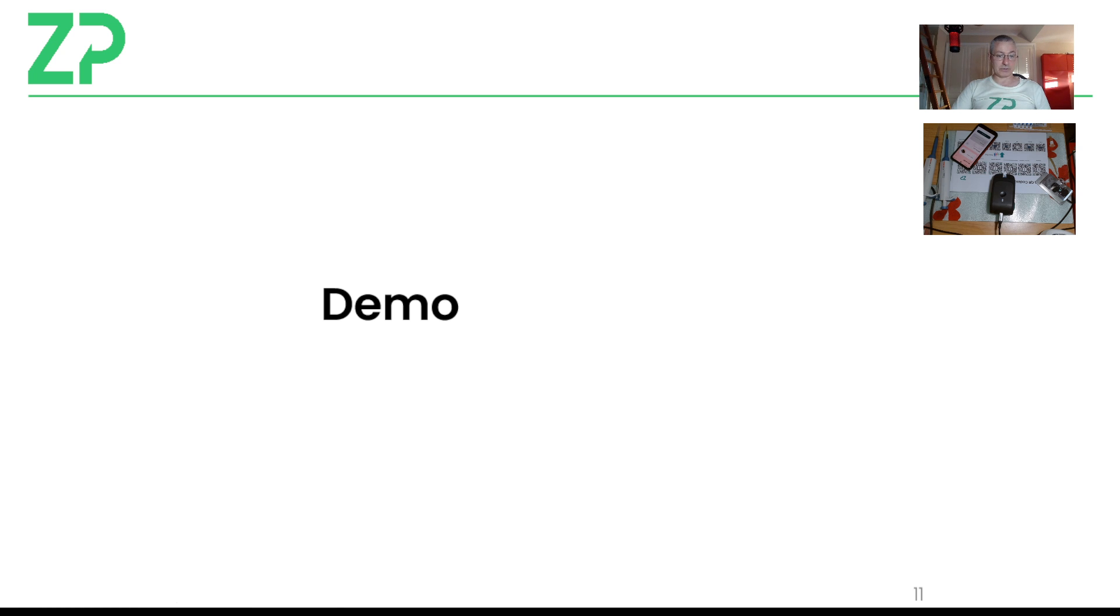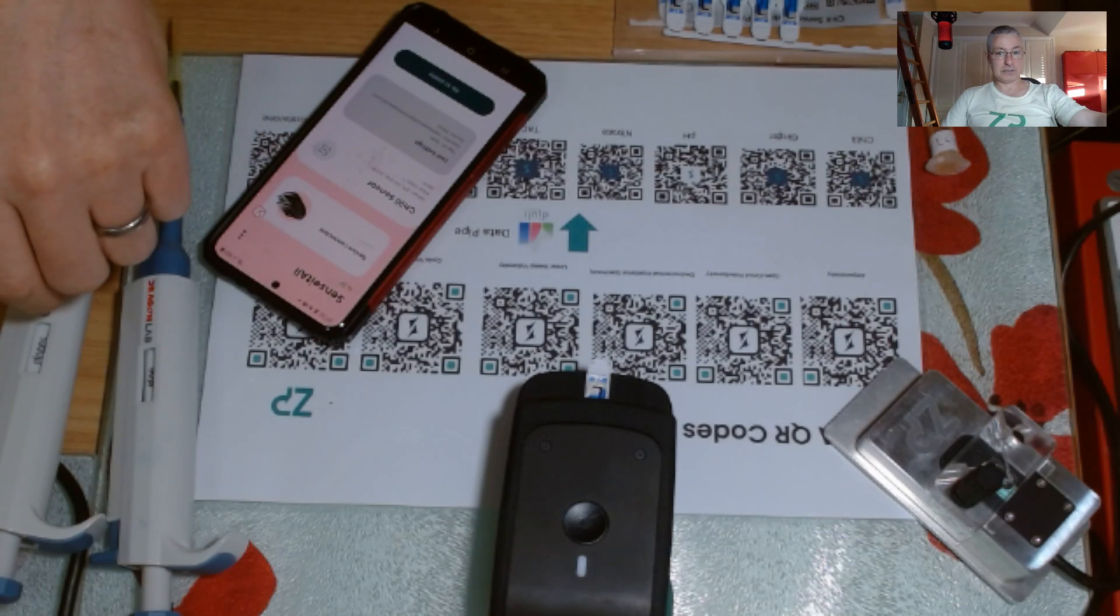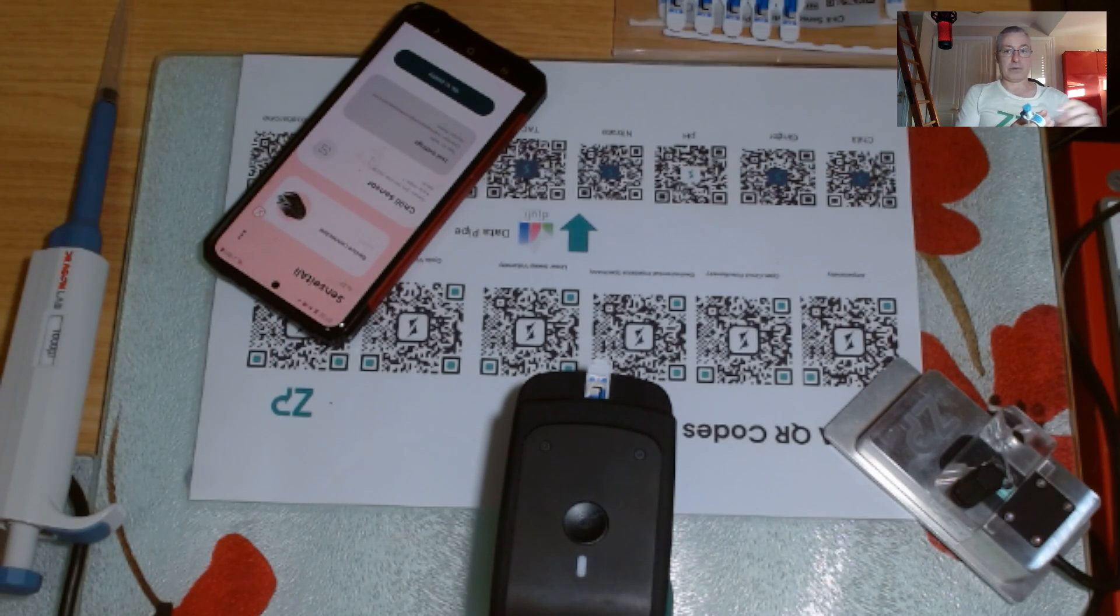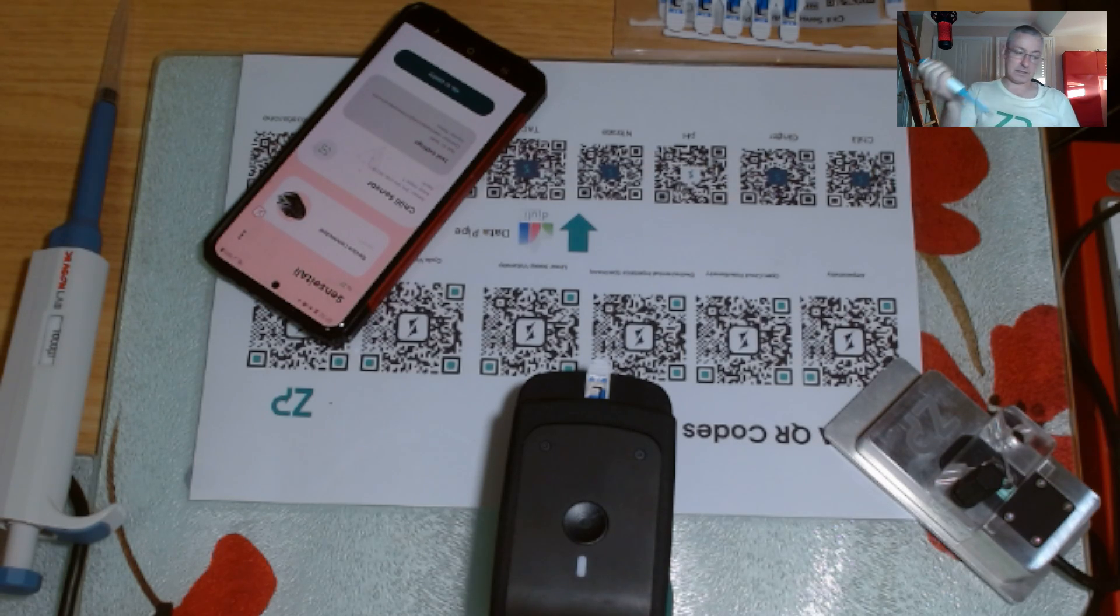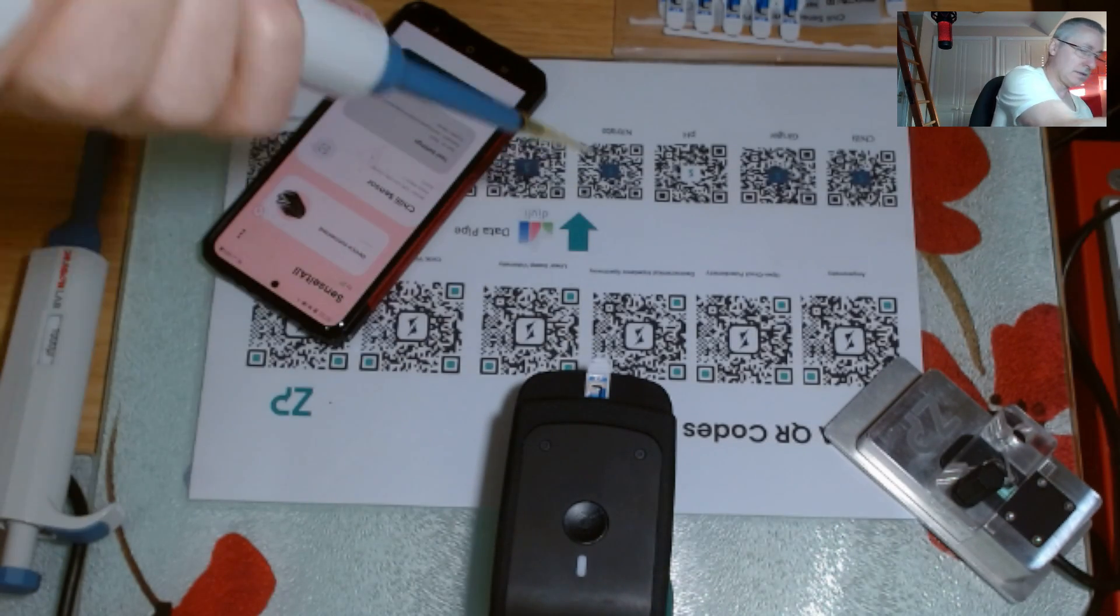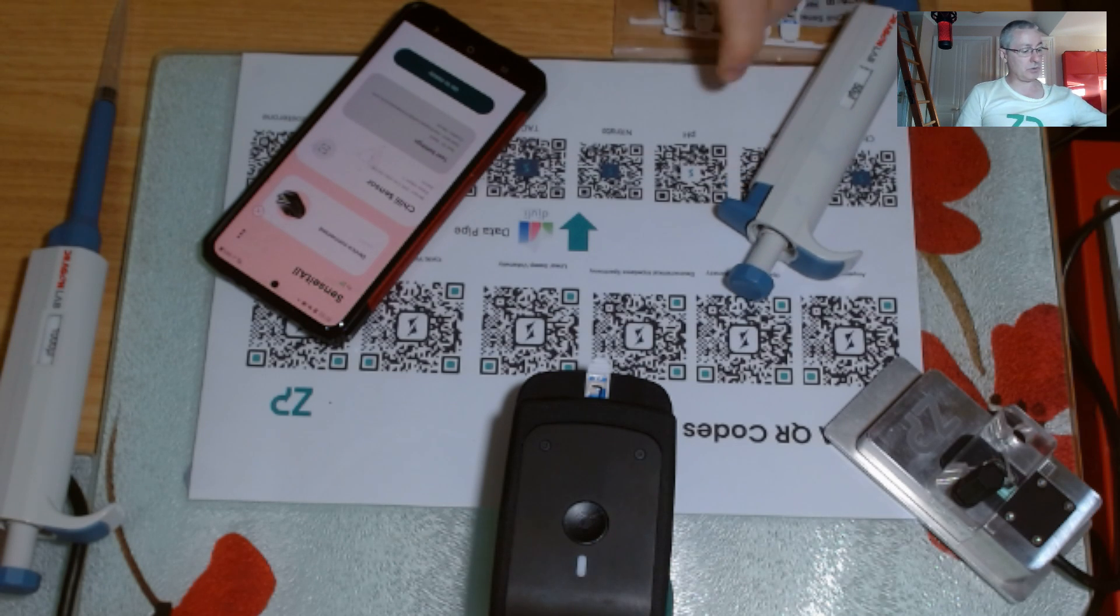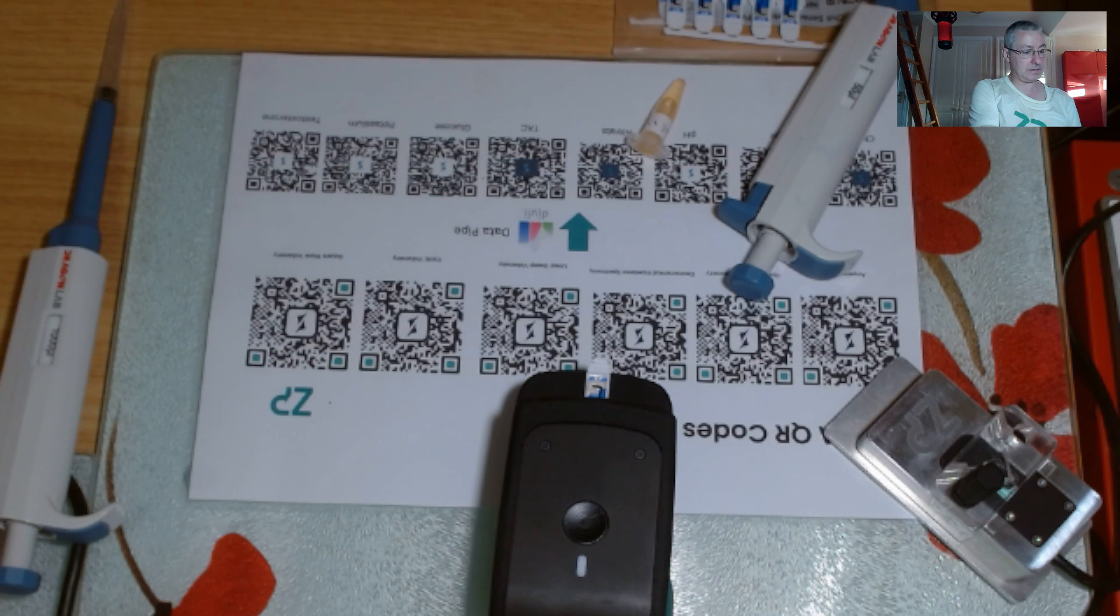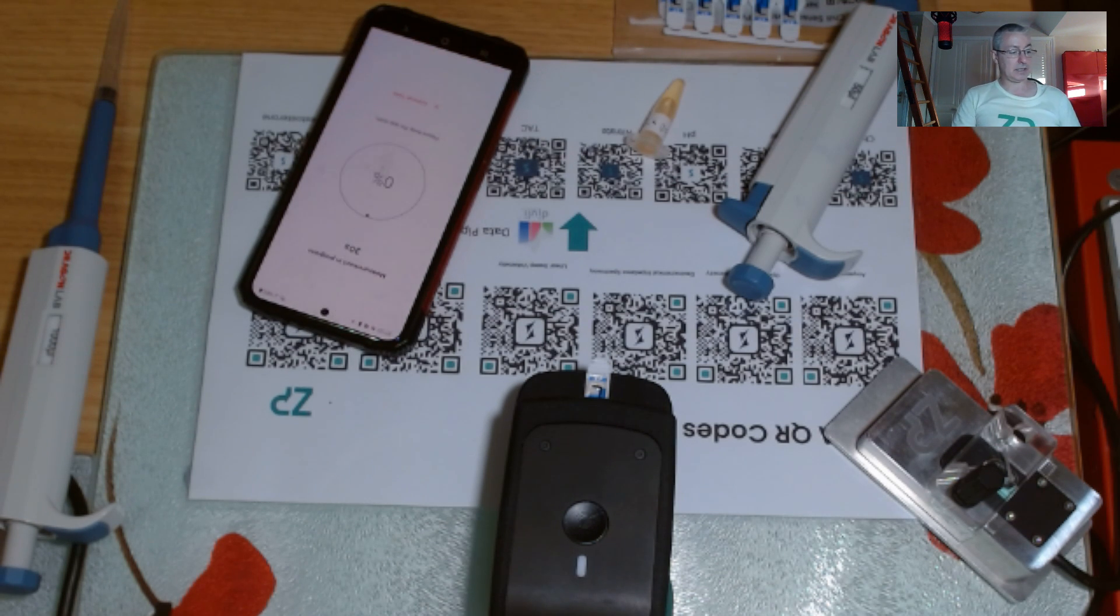So what I'll do is I will just change screens for a second. I'm just going to take 50 microliters of sample and just put it onto the sensor. What I'll then do is I'm just going to give it a name.